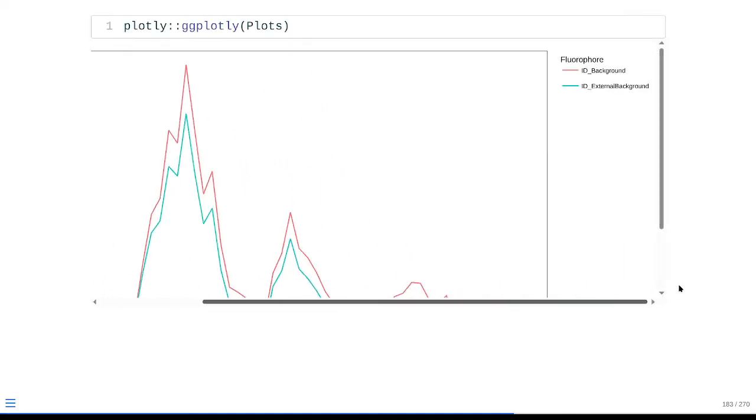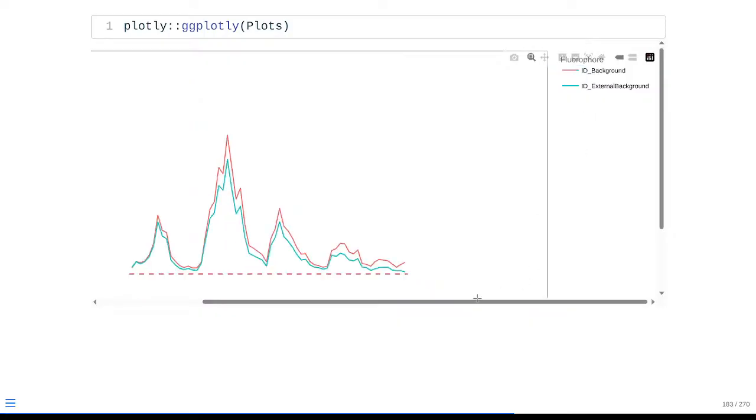So if we're comparing our two unstains, we can see in terms of just raw brightness that background, which would have been the internal, is a little bit brighter overall compared to this external. So in terms of that peak detector, the external is around 6,000, the internal unstained is around 7,200. So there's a little bit of difference when it comes to the brightness of these two.